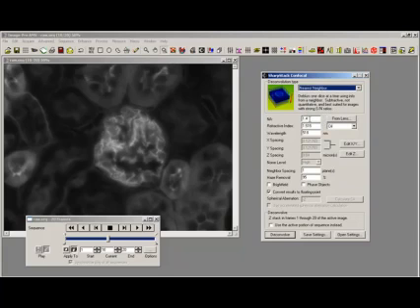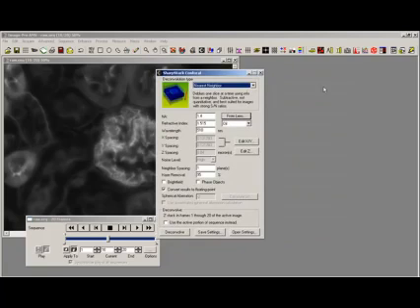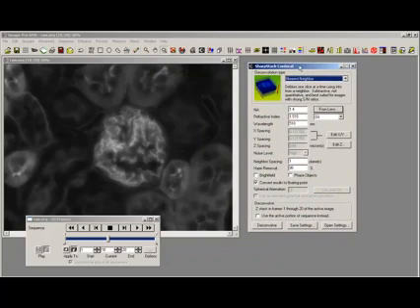Now the information that I need is numerical aperture and refractive index, and that all comes from the lens information. If there's a lens file in use inside Image Pro, you can just press from lens and say it was taken with 60 times, therefore use that lens. Other than that, we have got the wavelength. We know this is emitting at 518.